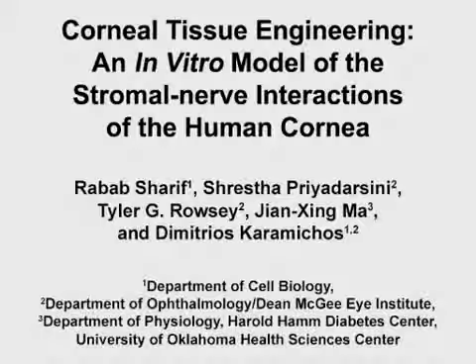The overall goal of this protocol is to investigate the cellular interactions between human corneal stromal cells and neuronal cells in their natural extracellular matrix. The protocol can be expanded to study corneal diseases and dystrophies such as keratoconus, diabetic keratopathy, and Fuchs dystrophy.